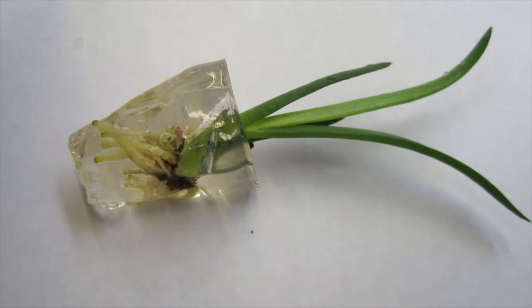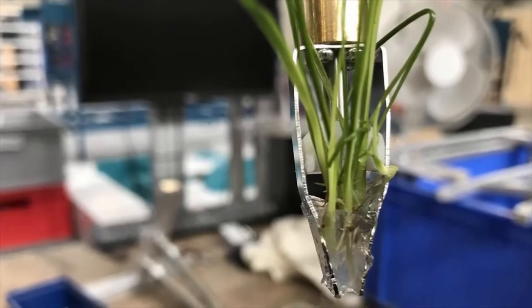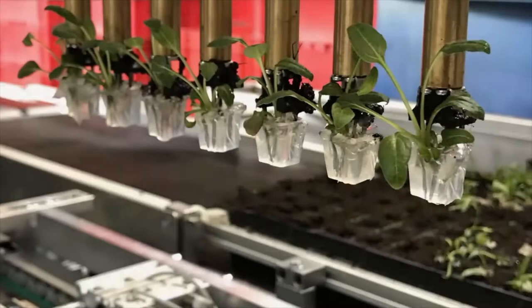Today, systems are available for automatic transplanting. Plants are grown in special trays and then transplanted by these automatic transplant machines. This transplanter was made in Australia and is very efficient in moving the plants from the lab tray into the flat potting media. Grippers gently grab the plantlets from the tray and move them to the flats.